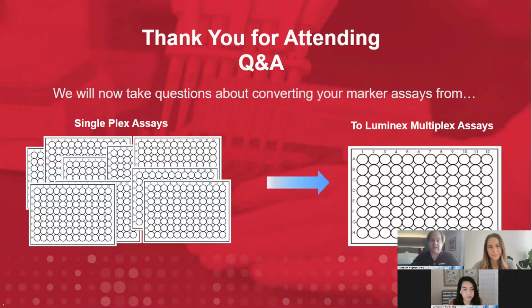And at the same time, it's the same with the reagents you have to use. You're going to use just that one well's worth of reagents instead of 100 different wells worth of reagents. And then since you're doing all that stuff with fewer wells, that data is going to be coming to you much faster than having to read multiple wells and having to analyze all those wells, put all the data together, because now you only read one well to get that data. So those are some of the ways that the multiplexing will save you time, give you data quicker, and because you're not risking the possibility of misloading some sample or reagent in multiple wells, you'll minimize that problem as well.